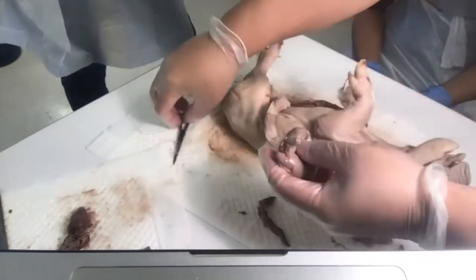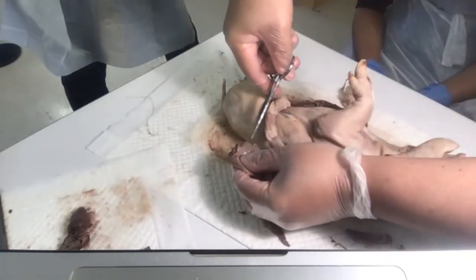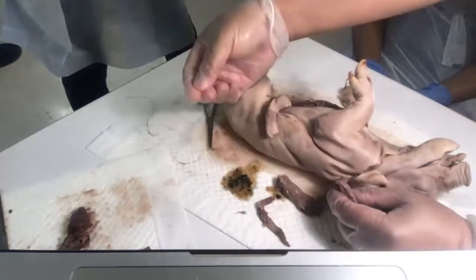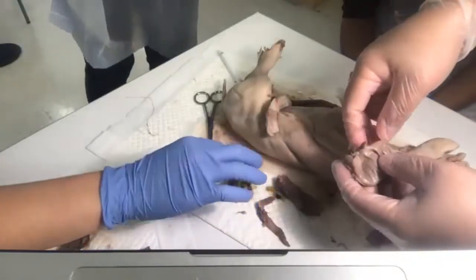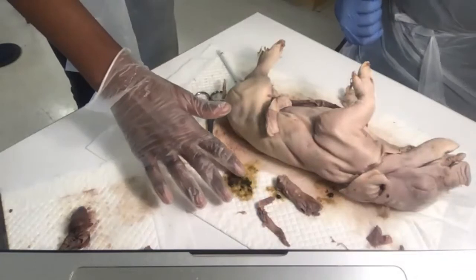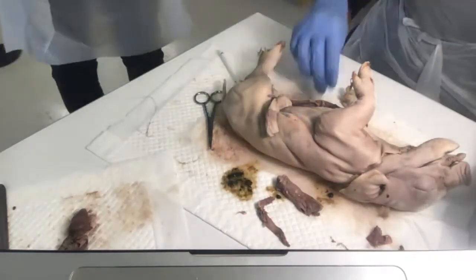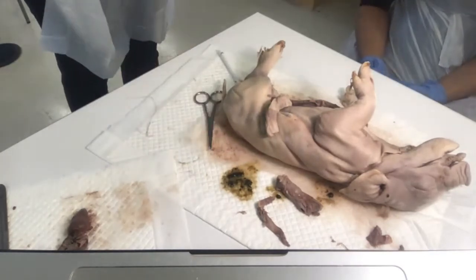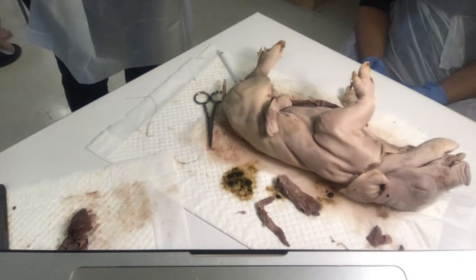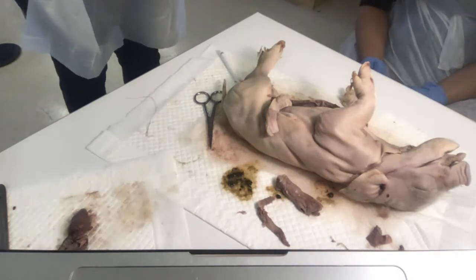Now, when I cut this thing open, this is my stomach. It's full of acid. Well, when the piggy was alive. But everyone feel this. Feels like the same stuff that was inside here, wasn't it? Feels like just that's not with the brown stuff. With the brown stuff. It's probably whatever the mom was eating. The green stuff. It's probably like the debris. Or the darker stuff from the lungs and whatever. Oh, remember, it's a fetal pig. It didn't eat anything then. Yeah, that's what I was saying. So it's like debris and cellular parts. Now, I washed out.